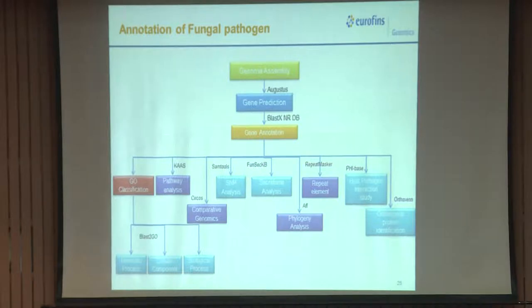For bacteria, there are tools like Prokka, which also have an online version wherein you can upload the genome, because bacterial genomes are small. You have online versions as well for those tools. But the tools which I am talking about, Augustus and others, are all terminal based ones. So you can identify the genes.